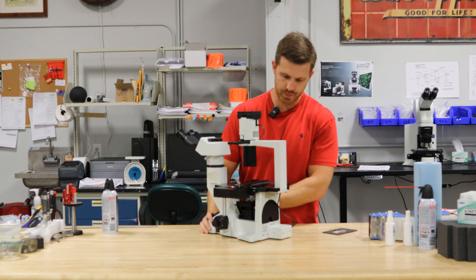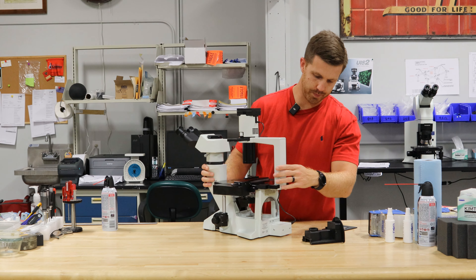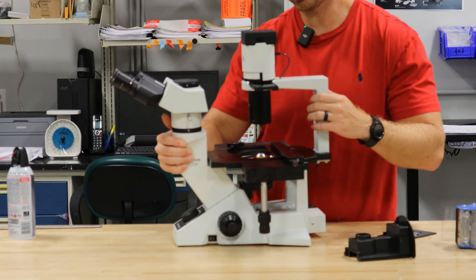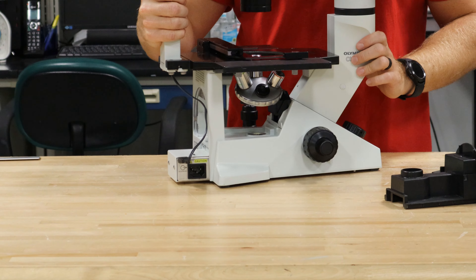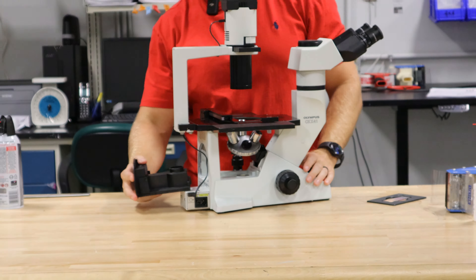Another thing with this scope: if you raise the nosepiece up, you can remove this slider and underneath there's a lens. This lens gets very dusty because of gravity. You can blow that lens off and it will enhance your image. Always blow off the lenses with a can of air duster or a hand air puffer before you clean the glass, so you make sure you don't get it scratched.